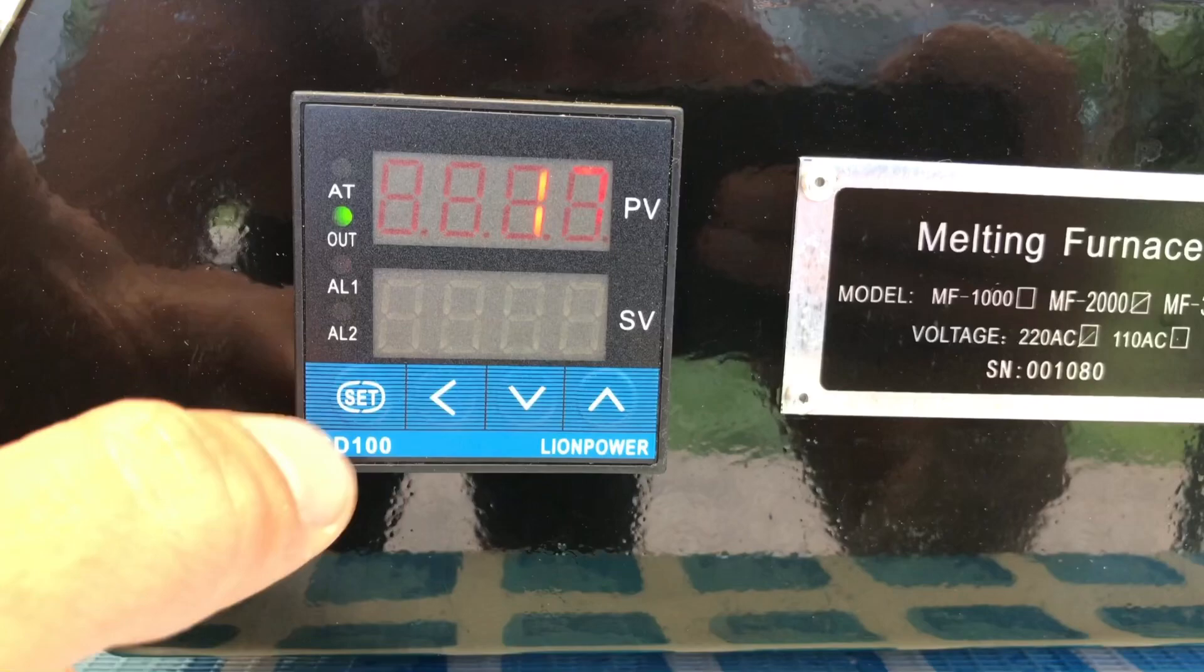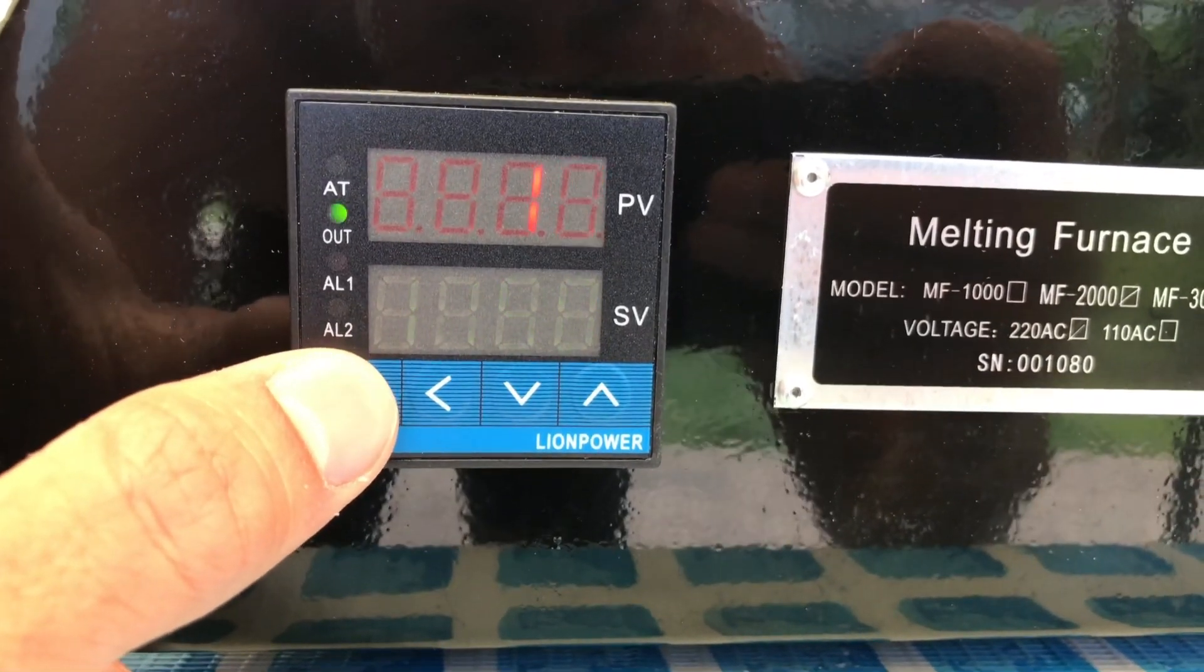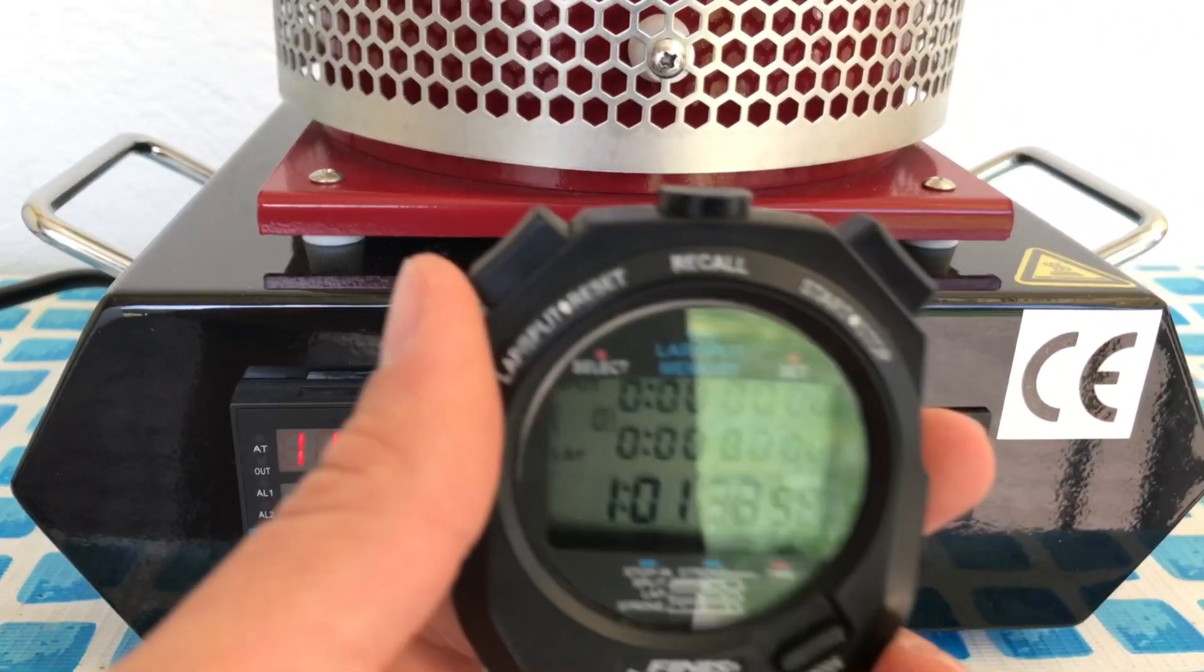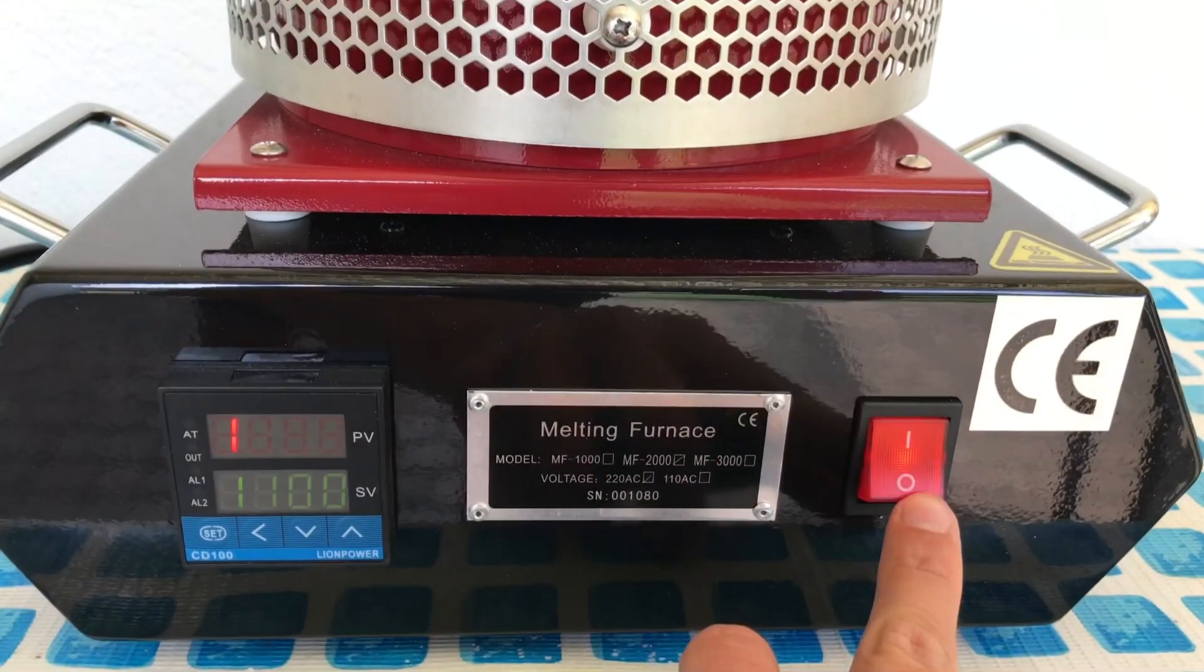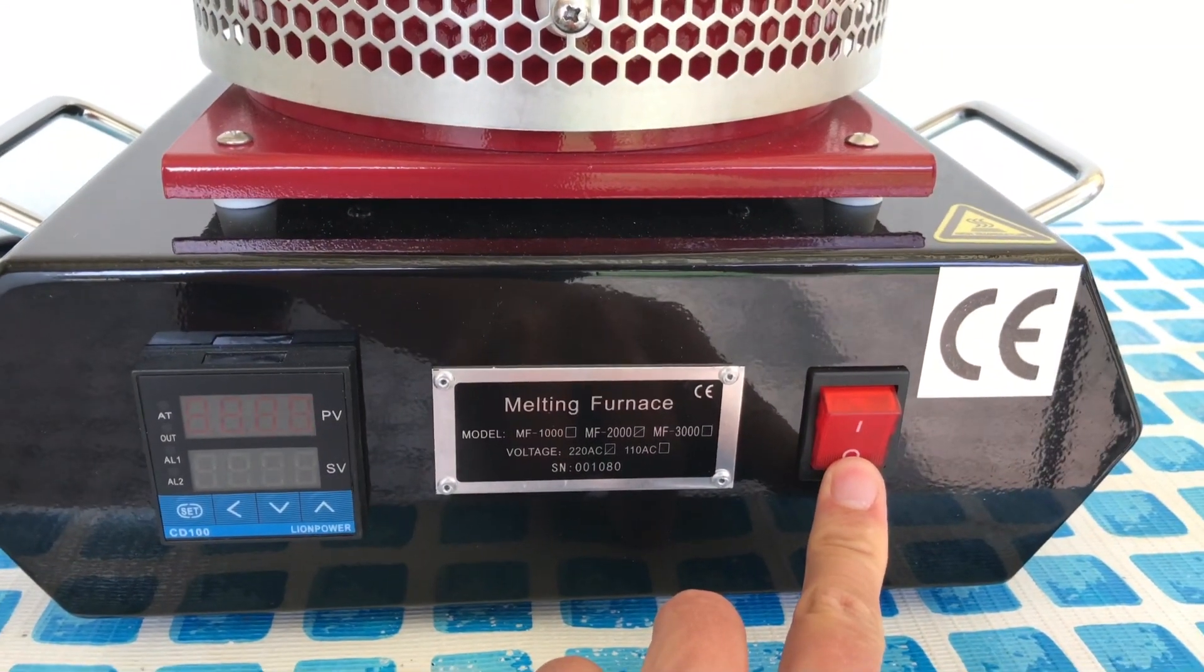Calcium melts at 842 degrees Celsius, therefore the temperature must be kept way higher than that. Once the temperature reached 900 degrees C, a stopwatch was started to let the reaction go for about an hour.